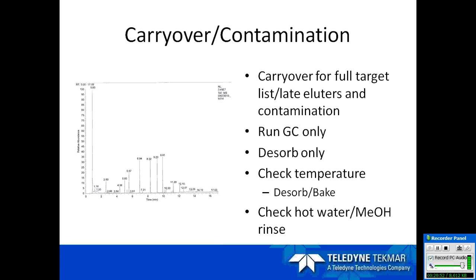When we refer to the sample pathway, we're talking about the syringe that is delivering the sample. It is also going to cleanse the needle, and it's going to clean up the sparge vessel as well, and any areas that reach that sample pathway.